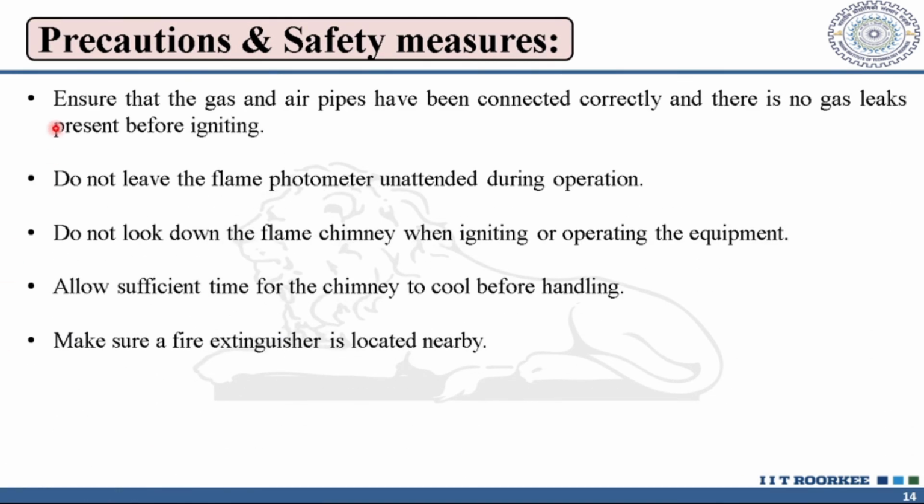Now you have to follow some precautions, like make sure that the unit is properly connected to the gas cylinder and there is no gas leaks. Ensure that the correct gas regulator is used and connected properly. It is not recommended to leave the flame photometer unattended during operation.